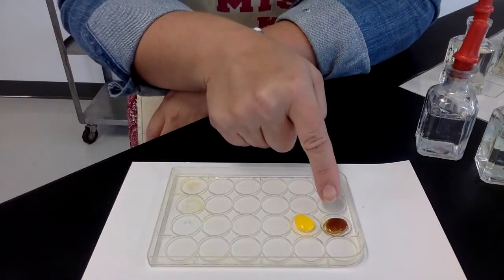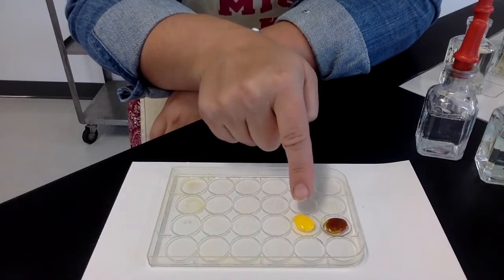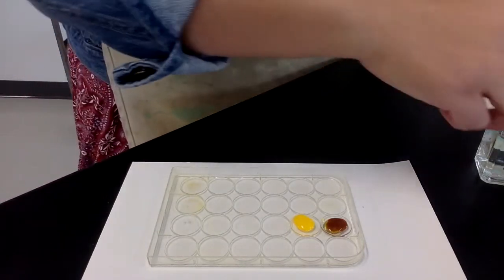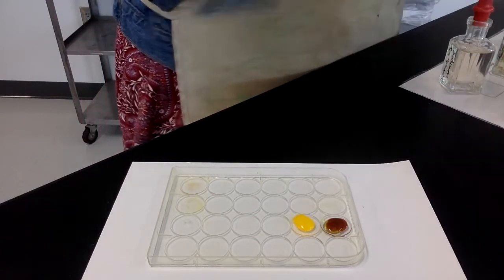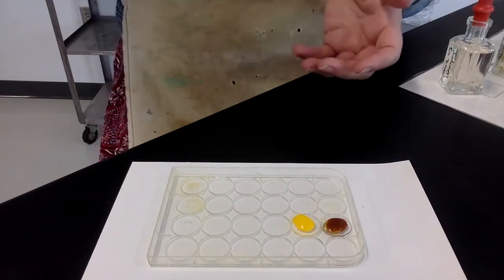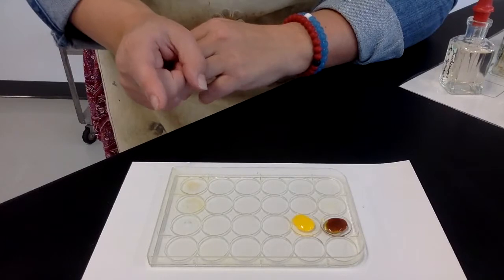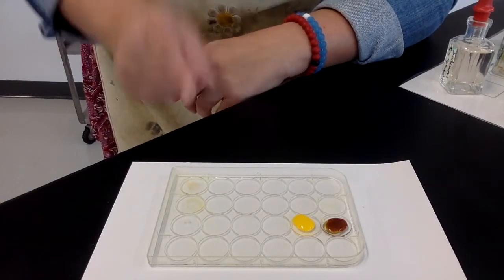And look at this one. See how this changed? It's definitely like a reddish color now. And then this one is for sure yellow, but that thick. So describing the precipitate, this is what it looks like. Okay, so your 4 ions are lead 2, nitrate, potassium, and iodide. And then you will write that formula, and then you'll switch the partners. So you've got a new positive with the new negative, a new positive with a new negative for your new compounds. And again, nitrates are always soluble. So in your new compounds, the one with NO3 is not the precipitate. That's the one that stays soluble.